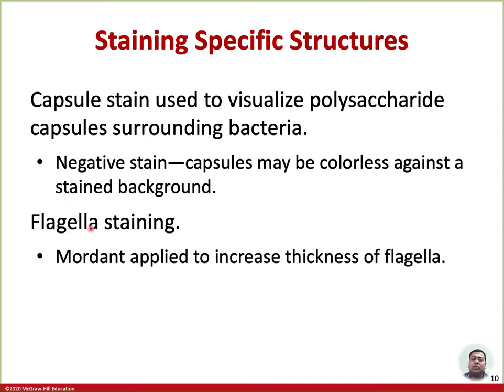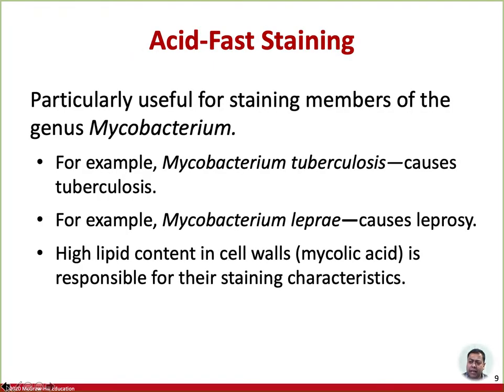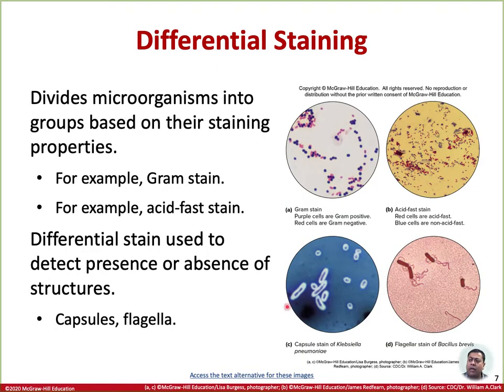There's a little distortion of the cell shape, and the cell can become counter-stained for even greater visibility. So let's take a look at the picture, and we will just repeat what we have just said. Say, for example, we are looking at this picture right here. The background looks bluish, but it is essentially blackish. It's just a little bit pseudo-colored in the process of the picture.